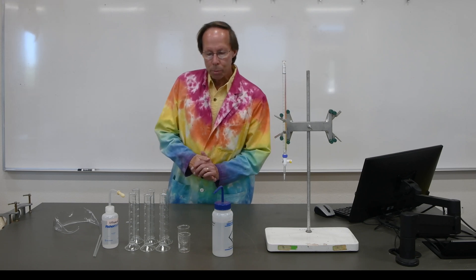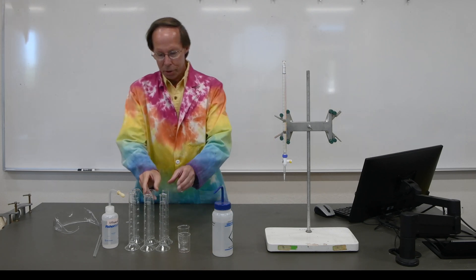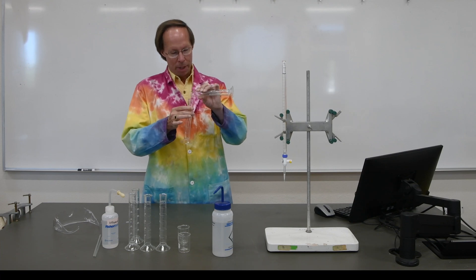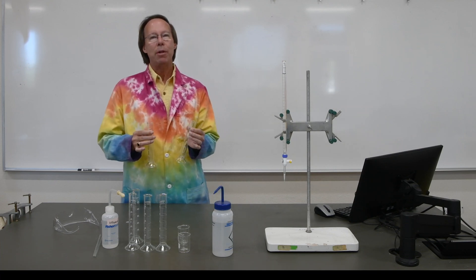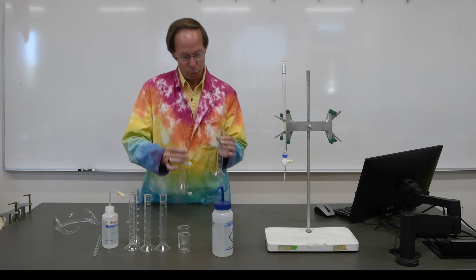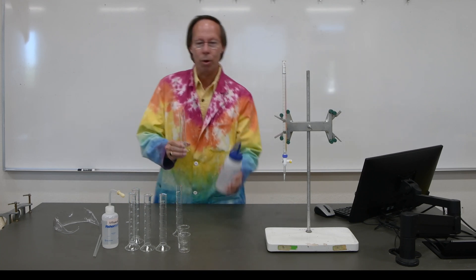For our first experiment, we're going to measure out water in two 50 milliliter graduated cylinders. We're going to record the volumes in each, combine them together, and then measure the combined volume to see if it is very close to the sum of the two individual volumes. We want to put between 15 and 20 milliliters of water in each one.